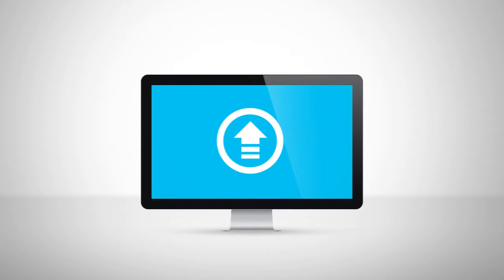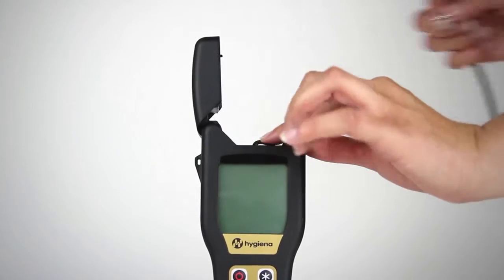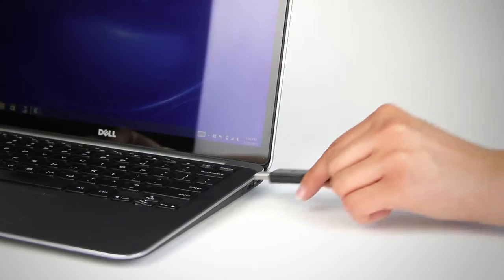Now that you have test results in your unit, it's time to upload the data to SureTrend to be able to run charts and graphs. Make sure your unit is connected to the data port and turned on.